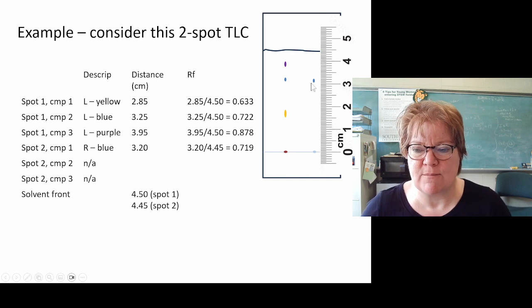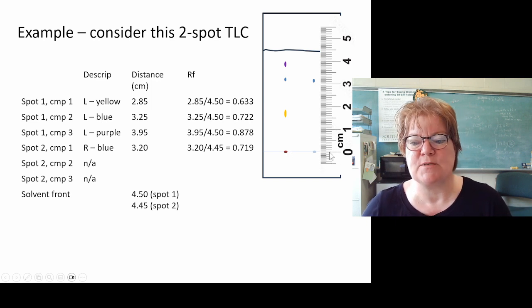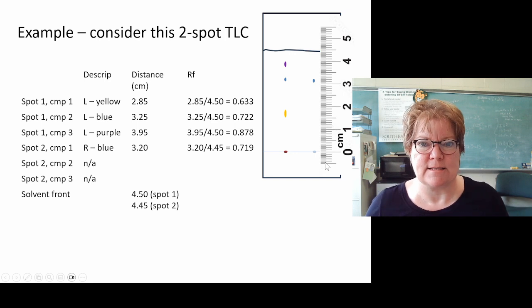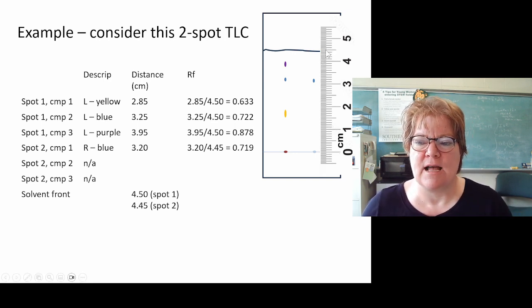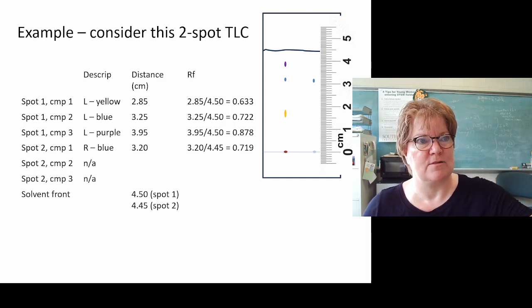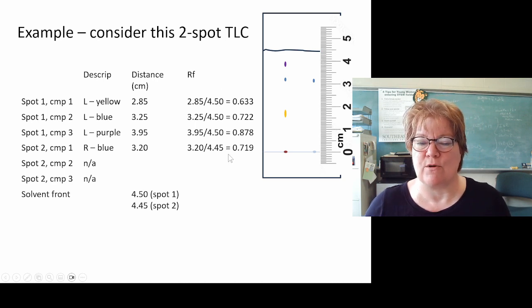So I'm measuring from this line. Because I'm measuring from this line, I just lined up this 0 right on that line. This particular ruler scale has a negative area where if you're not starting exactly at 0, that's weird, but it's fine. And then I wrote these out to the nearest half of a tenth of a centimeter, 100th of a centimeter, whatever, to the nearest 5 or 0.